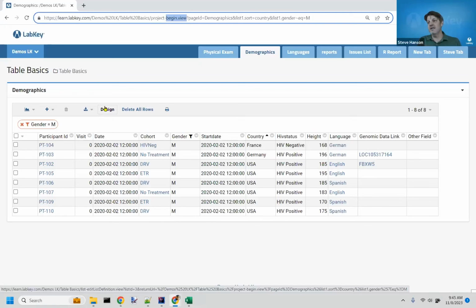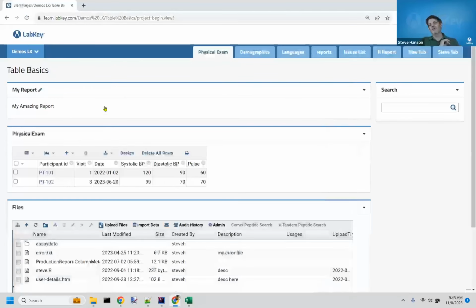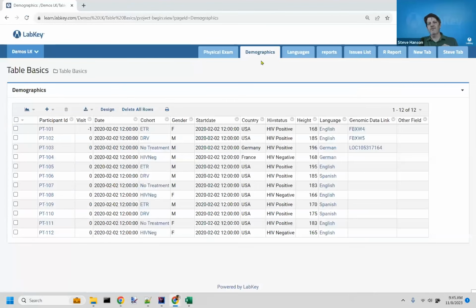Those are the 4 basic parts of the URL. And then the 5th part's details. Details come after the question mark, and that's all like filters and whatnot. And again, you can operate the URL. Like if I rip off all the details, it'll give me the default view of the page again. Actually, I moved the tab there. I didn't want to do that. But if I go back to the tab.